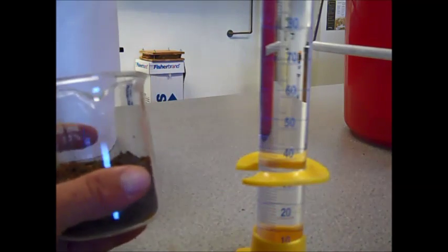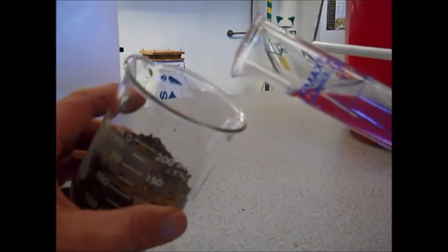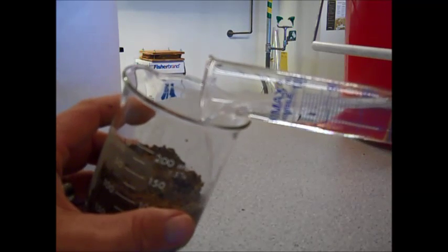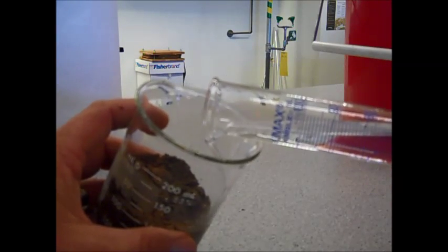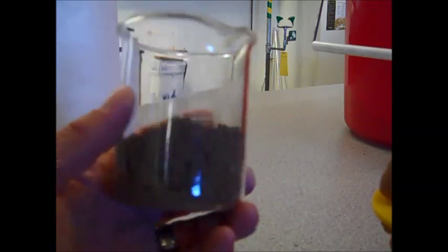The way I'm doing this in the 100 to 100 measurement is I'm going to tip this to the side a little bit. I'm slowly adding water until all of the pore space is filled. I'll know when all the pore space is filled because free water will be standing. So I'm just slowly adding, and then I'm looking. All the water is absorbing into the soil.